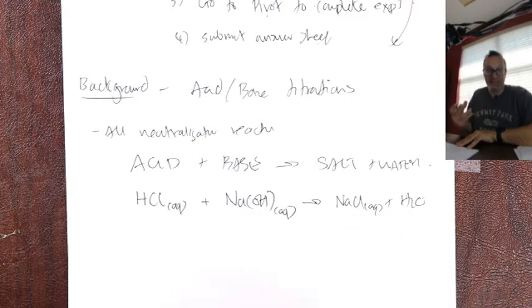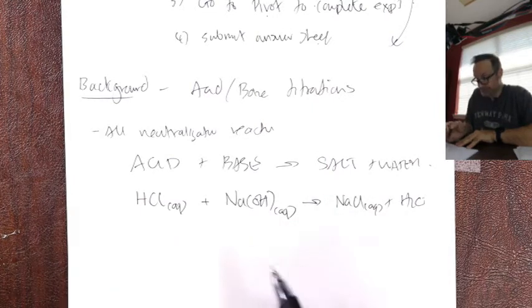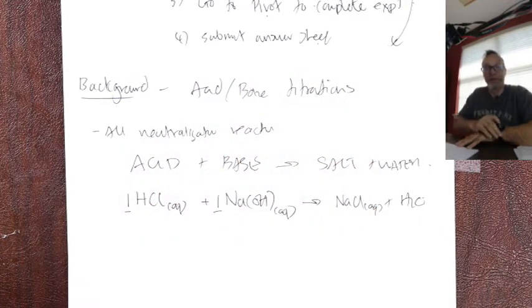If you have any acid left over, it's one color. If you have any base left over, it's another. And so when we see the change, it goes from colorless to pink when I have an excess of OH, right? We'll see that in the video. I stop right when it changes color. So when you do a titration, you always stop right when you get a color change. That means this is perfectly in ratio at that point.